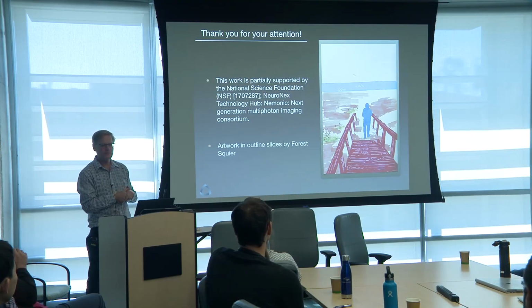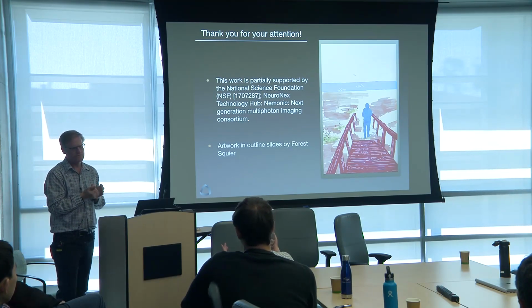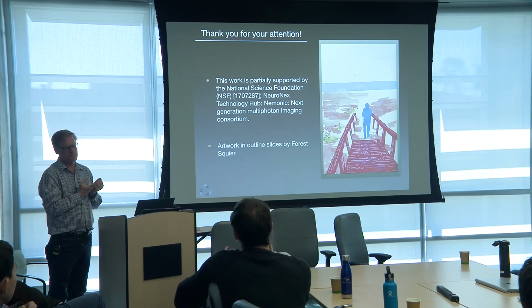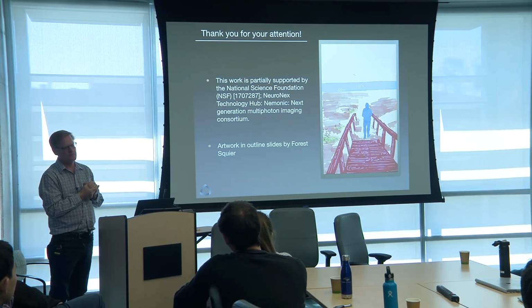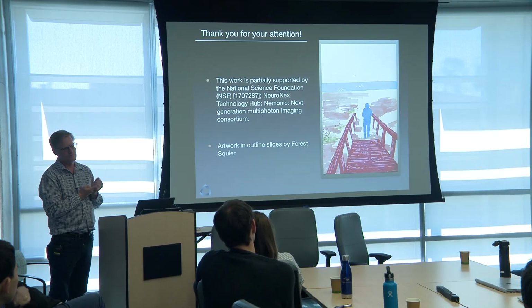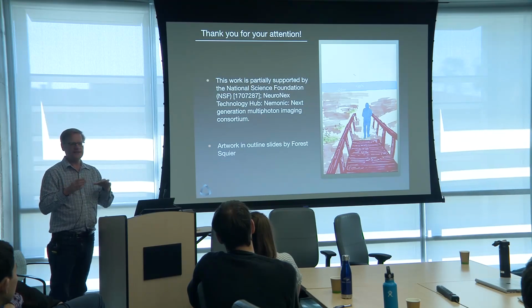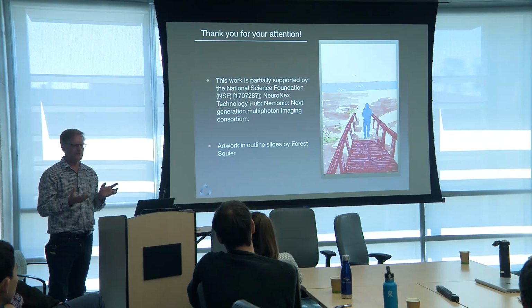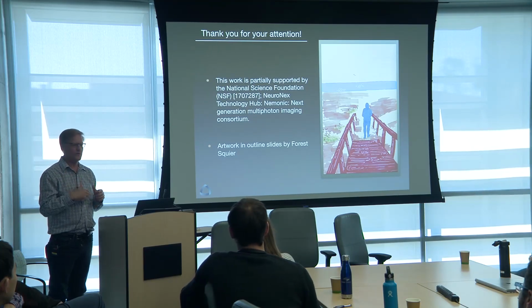I have a clarifying question. So earlier you said you could image your field of view either by moving your sample or by moving the beam, correct? Can you explain why you might want to do one versus the other? I think almost exclusively in this community, you're probably never going to want to do specimen scanning, right? Because you really got to move quicker.